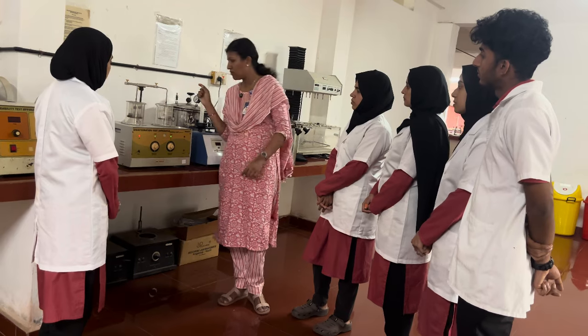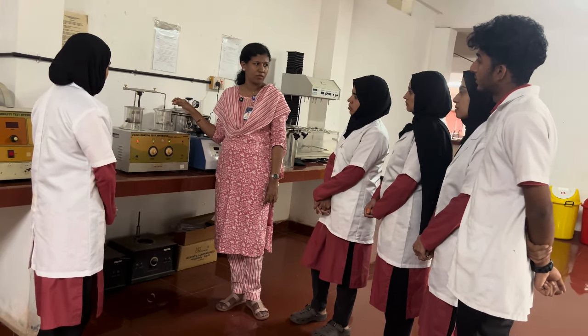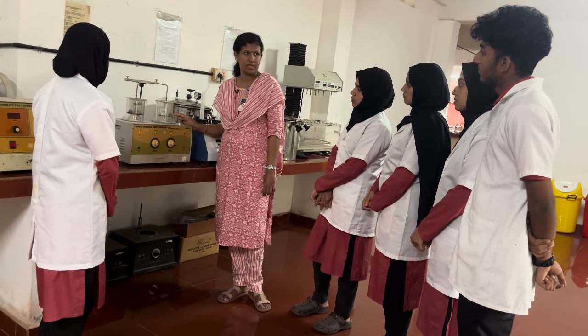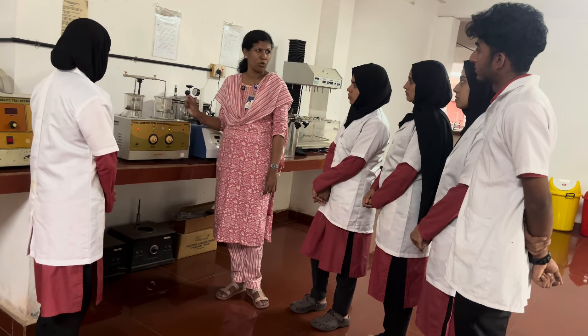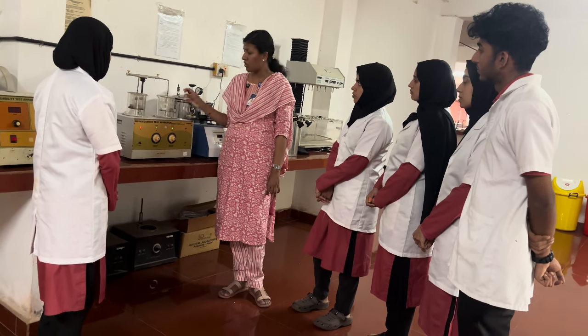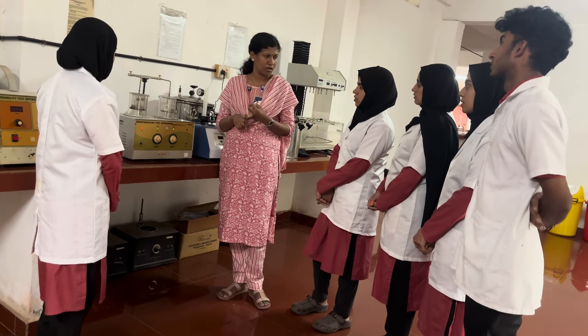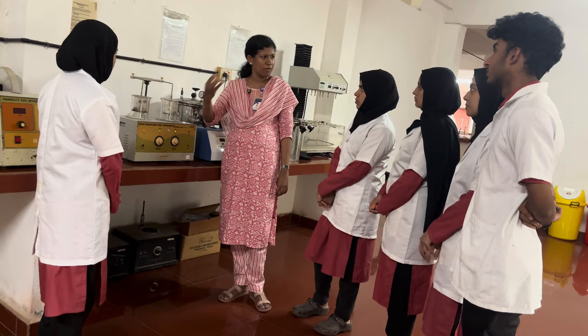Time. We have to observe each tablet for disintegration. We have to check whether each tablet has disintegrated, and when complete disintegration has occurred, we have to note the time. There are different categories of tablets: uncoated tablets, film coated tablets, and enteric coated tablets. So the value will be different for each.